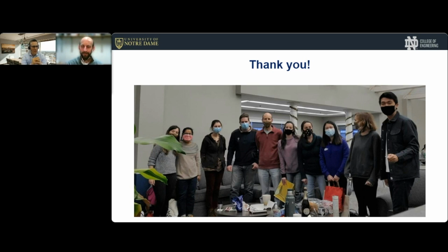Okay, the next one is from Sangli Srinivas from Indiana University. It's not really a question, more please combine fluorescence microscopy with OCT. So it's more of a comment.